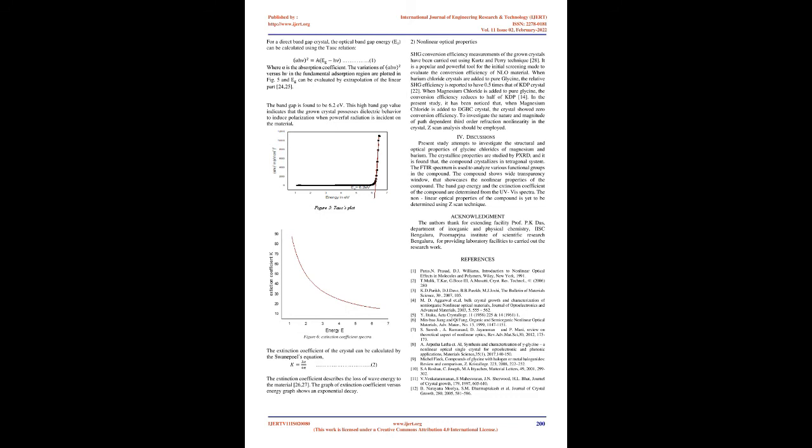Optical studies. 1. Linear optical properties. The UV-visible spectrometer from Perkin-Elmer Lambda 935 was used to study the linear optical properties of the titled crystal. In UV spectral studies, the optical transmittance window, the transparency, and the lower cutoff wavelength are very important for the realization of SHG output in the range using a diode laser. When the samples are transparent, an attempt is made to record the region in which they behave as nonlinear optical material. The ultraviolet spectra were therefore recorded from 190 nm to 1100 nm.